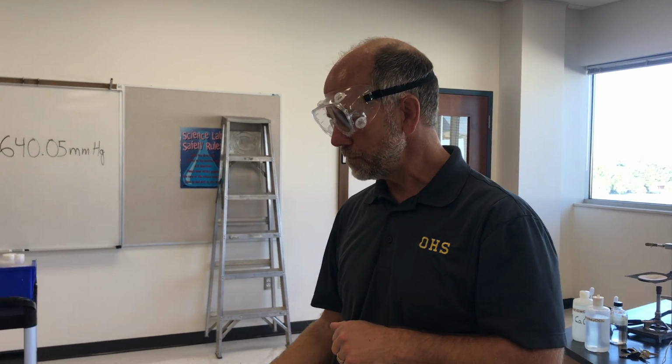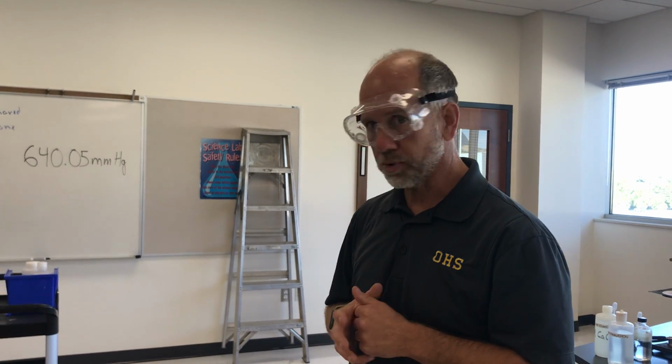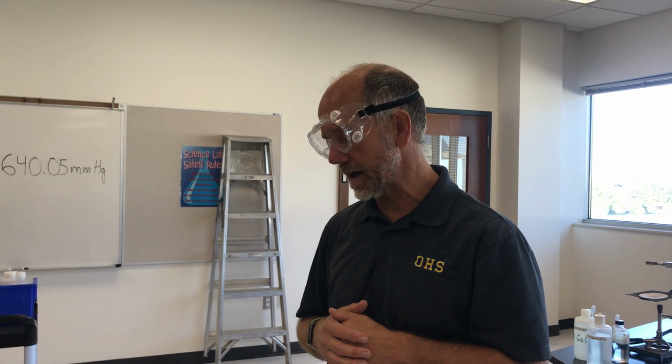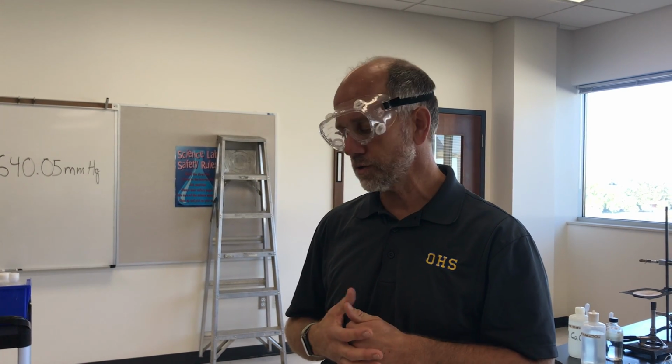Flipping the lab over then, you'll notice that there are 2 calculations to do. Please don't guess at how to do these. The description of how to do these calculations is very clearly laid out in the screencast that you should have already watched.